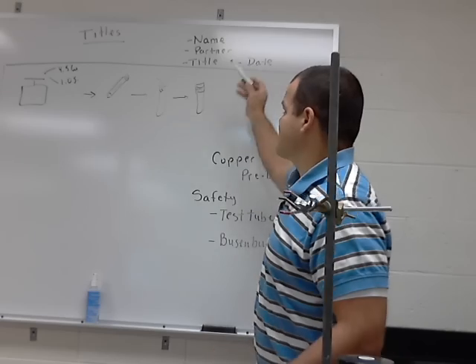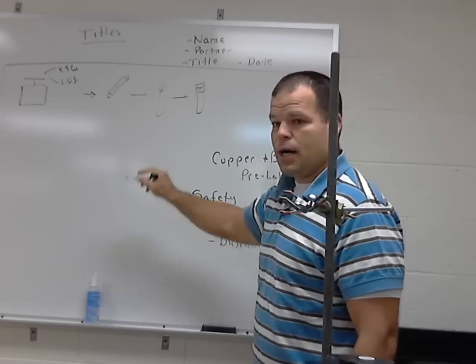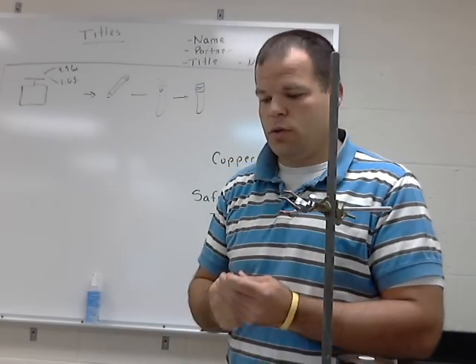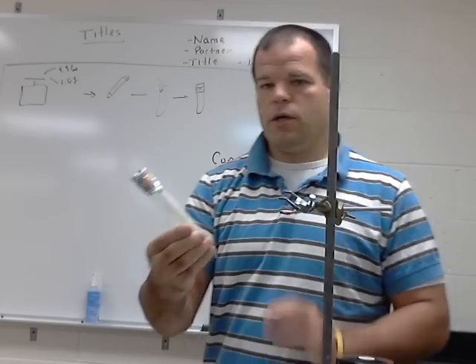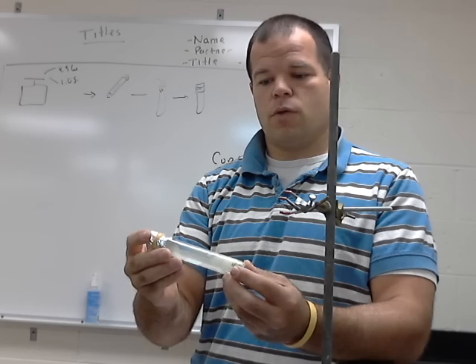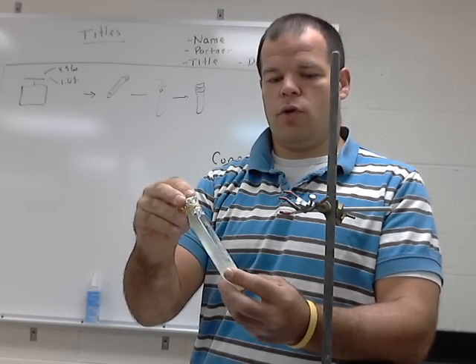So you should have your headings completed, pictures drawn out, and I would suggest mock data tables, so you know what information you're supposed to be gathering at this point. As far as the actual lab is concerned, here is an example of the test tube covered. Now the test tube is dirty. It's okay that it's dirty. Here's a rubber band. It's covering aluminum foil over the top.